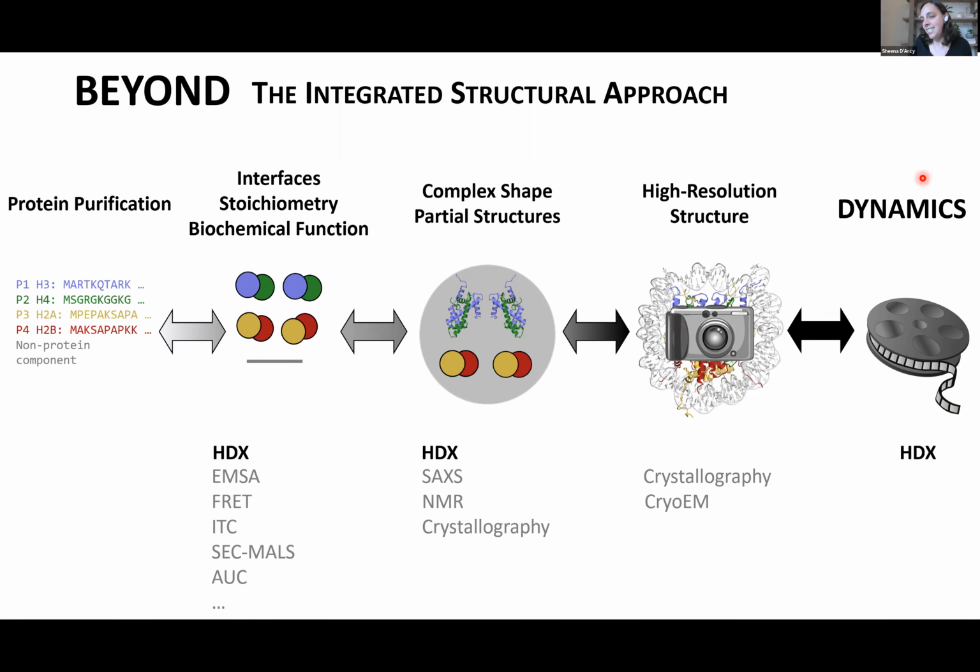And that's what I've attempted to depict here with this cartoon, by instead of just looking at our complexes as static, sort of as snapshots like we often see in X-ray crystal structures, we now try to visualize our proteins in movie form. We can use HDX to understand their dynamics.